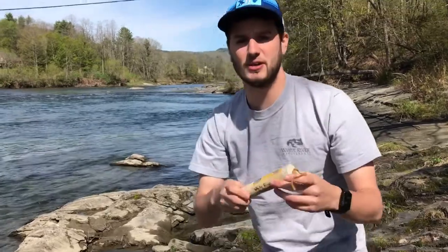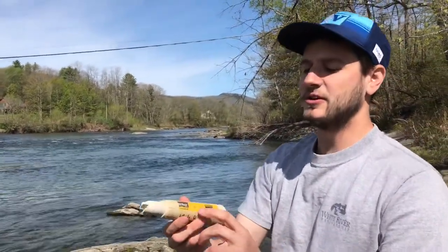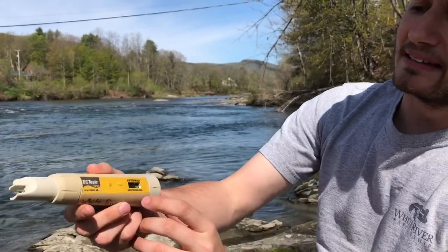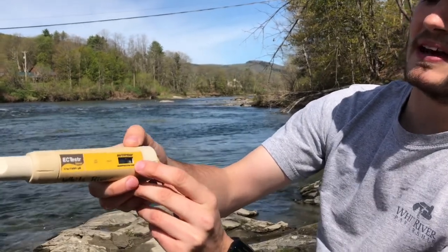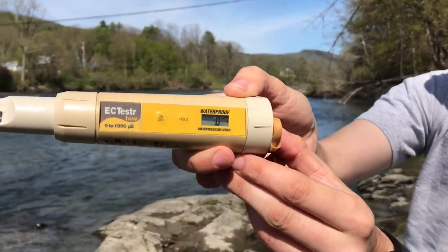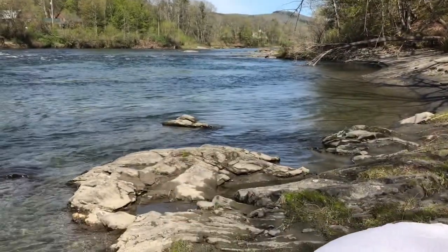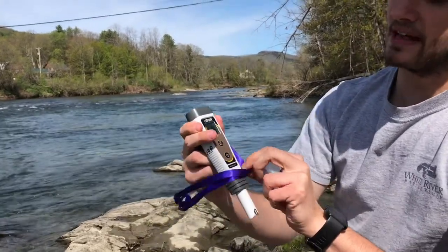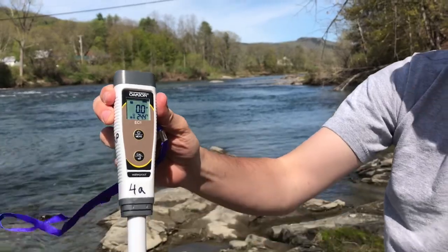The first thing you need to do is make sure that your pen is functioning. Press the on button, and to get a successful reading you need to make sure that before you put your pen in the water it reads zero microsiemens. This also happens on the Oakton pen — there's a power button, you press it on, and it takes a second and you'll see a reading of 0.0 microsiemens.